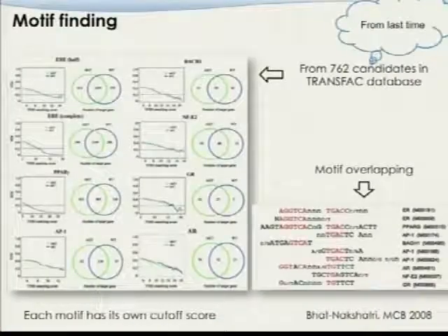Okay? So last time, what we really talked about was the peak finders, which are the analyses specific to transcription factor binding, and also motif finding. Those are the two things we talked about. Any questions so far?